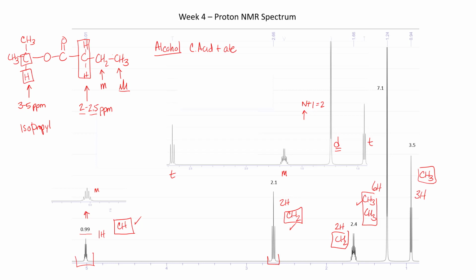And over here, it's the 4-carbon acid, so that would be butyric acid, so that would be butyrate, which is the 4-carbon acid. Just for the sake of argument, a 1-carbon acid would be called formic acid. There are no formates in this, but that's formic acid.